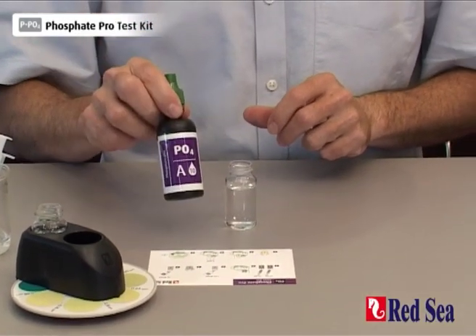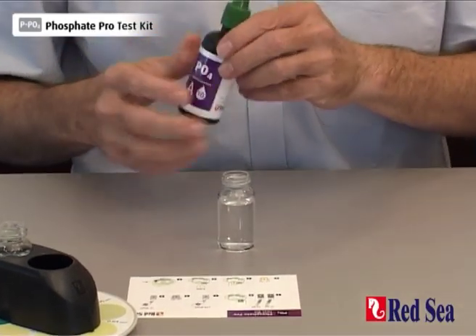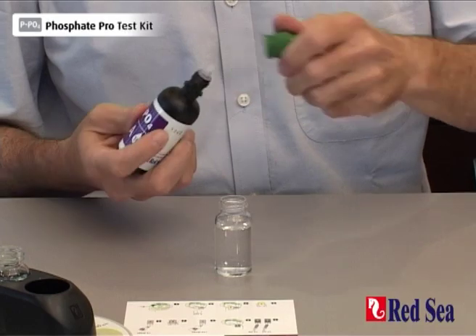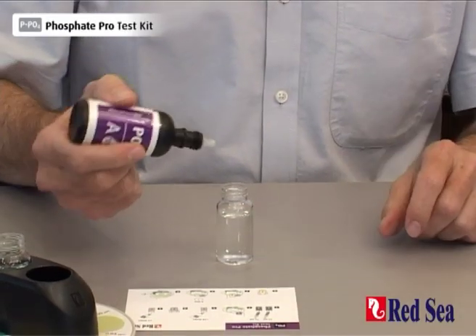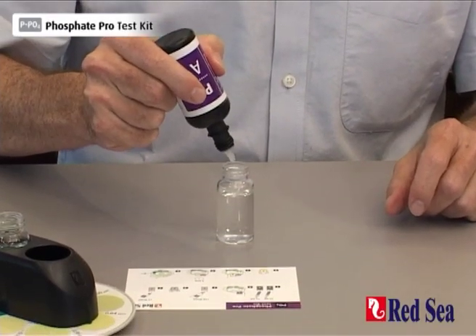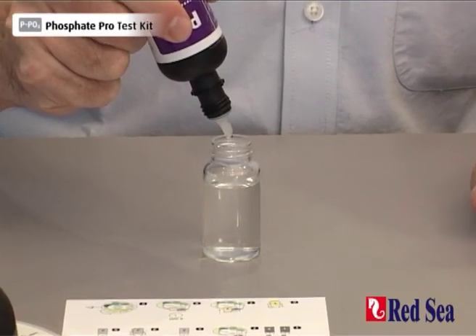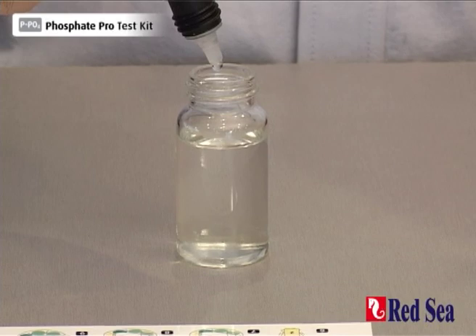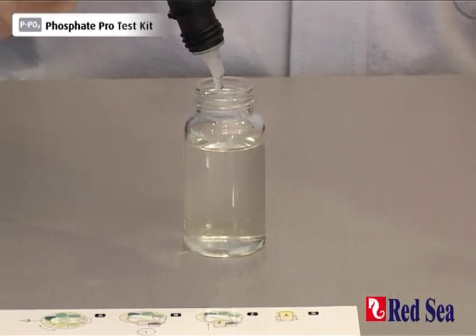First, we have to add 10 drops of phosphate reagent A. One, two, three, four, five, six, seven, eight, nine, ten.